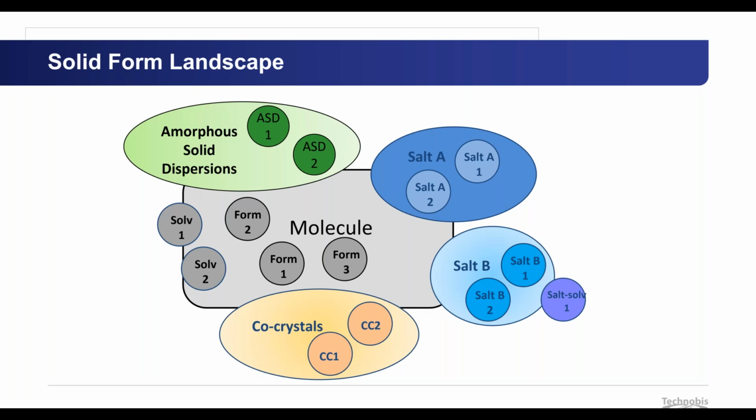So you need to find a way to stabilize this amorphous state. Of course, you can make different types of amorphous solid dispersions, and I will shortly also give you a few ideas on how to do this. Need to speed up a bit.